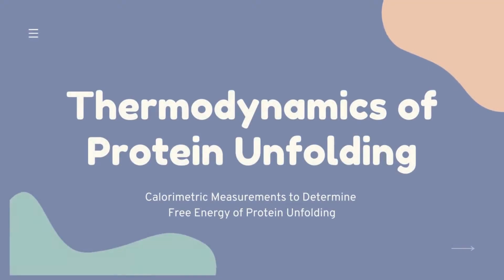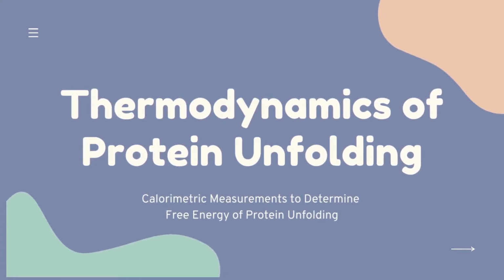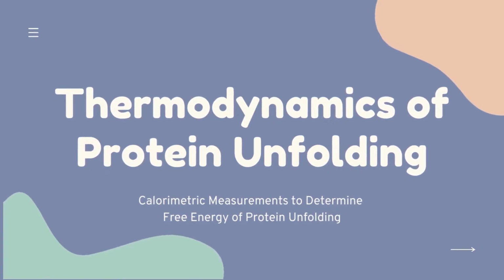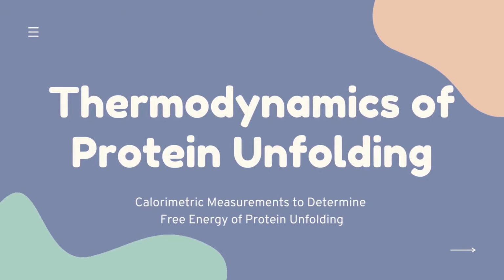Good day everyone, we are group number 5 and today we are going to report on activity number 2, the thermodynamics of protein unfolding. In this activity, we used calorimetric measurements to determine the free energy of protein unfolding.